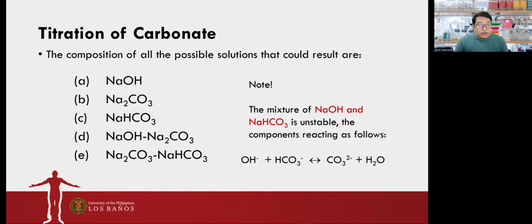So dito, your hydroxide can act as a base and your bicarbonate ion can act as an acid, forming your carbonate ion. Okay? So pag nagtitrate tayo, hindi natin alam kung sino yung nag-react with OH minus, si bicarb or si H3O plus. So that's why the mixture of NaOH and sodium bicarbonate is unstable.